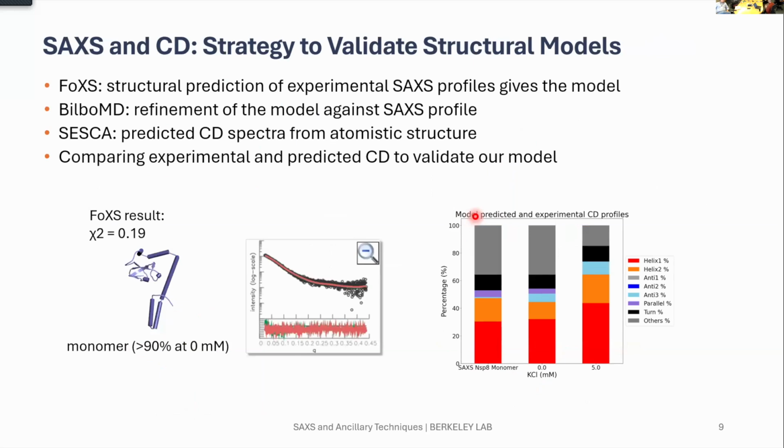Now we see that there is this complementary connection between SAXS and CD data. And what about a more atomistic, structure-relevant connection?